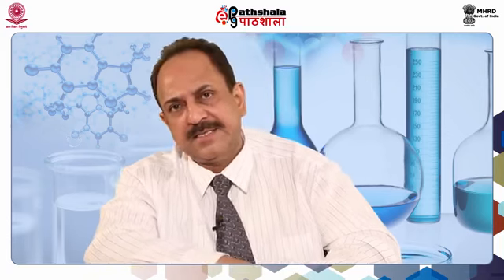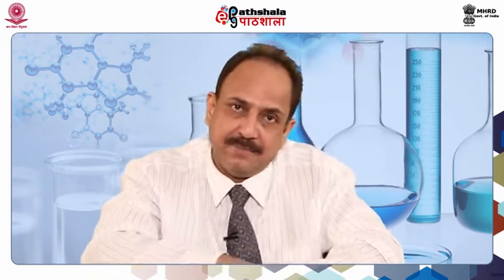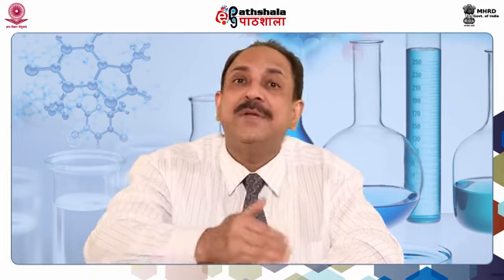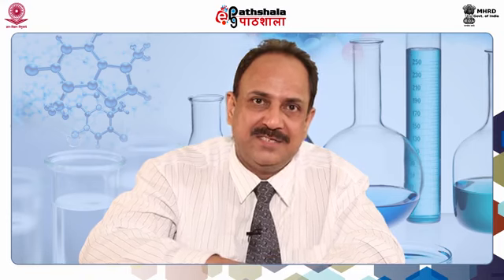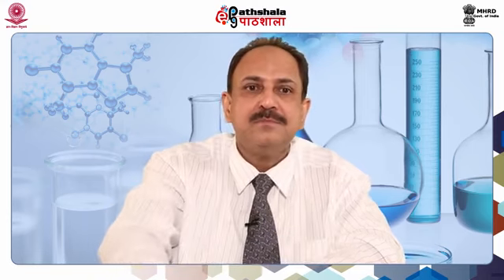Then we learned in this module how to detect the active site binding residues. This helped us to complete the picture with addition of the literature information, so that then we were able to appreciate the real total complete active site in 3 dimensions, real 3 dimensions, with the depth also shown in addition to width and height.